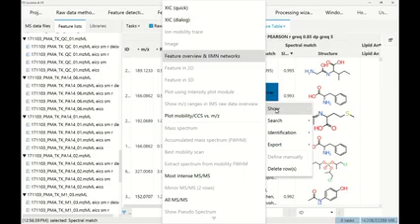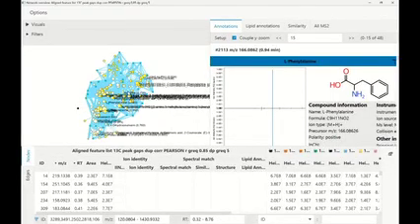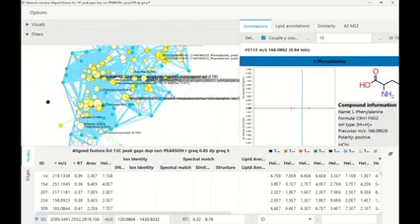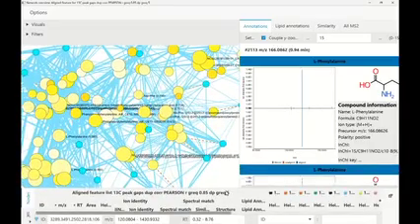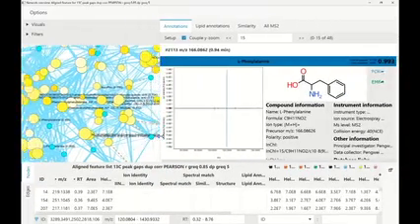So right-click, show feature overview, and then you're going to see something like this. This is the molecular networks, and it looks a bit weird because I zoomed in for you with all the labels here. But you're going to see that there's directly a feature table, the network, and annotations.